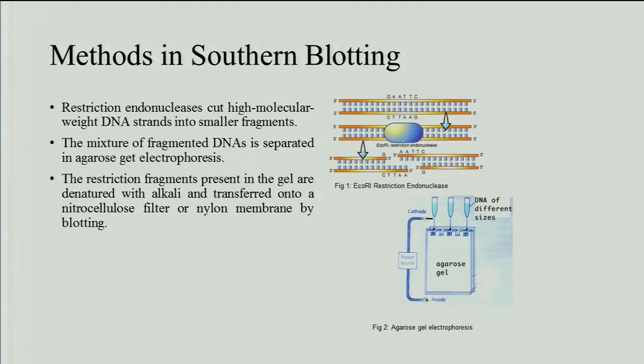So, how does the southern blotting work? Another thing you need to know, again I needed to know, so I am just telling you, is what are restriction endonucleases? It is like scissors. So, if you have a long DNA, you can cut a section of it if you want to study it, and those are these restriction enzymes. Again, all these techniques work for smaller fragments of DNA.